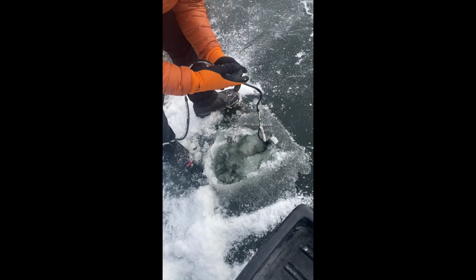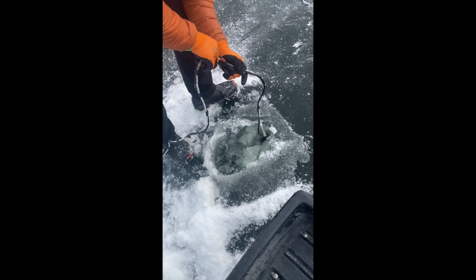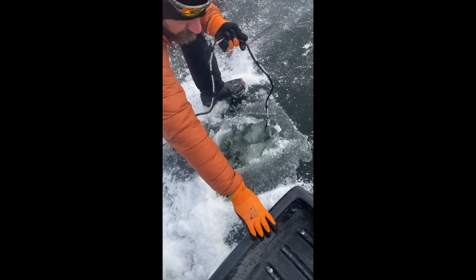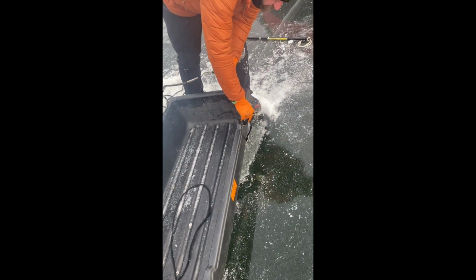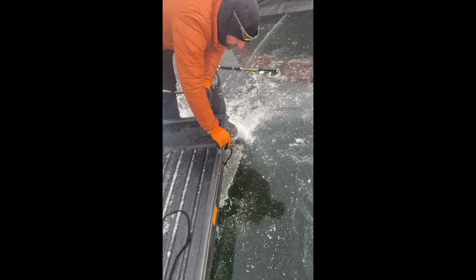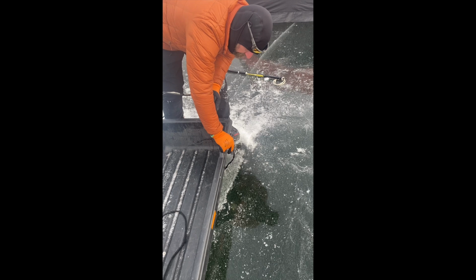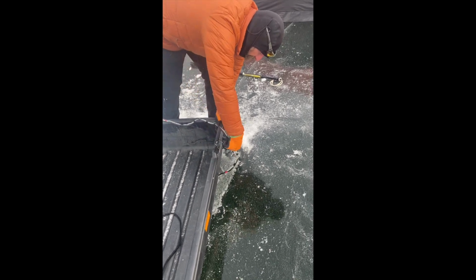Okay, great. So now we're going to collect measurements every half meter, starting from the upper surface of the ice. Our cable is metered in half-meter intervals, and what we do is cover the hole in the ice with a sled or something else dark to make sure we don't have too much light leakage. So here is our half-meter measurement from the upper surface of the ice. 62.93. Okay, here's 1 meter.